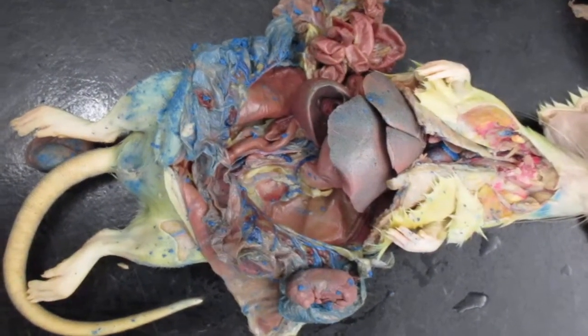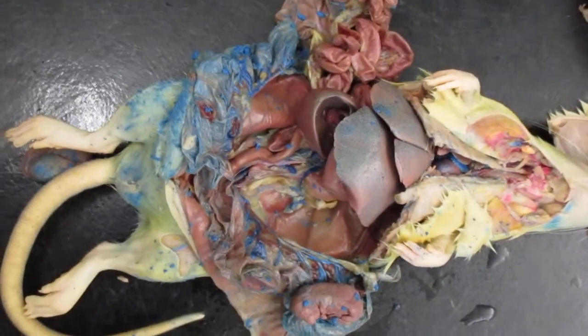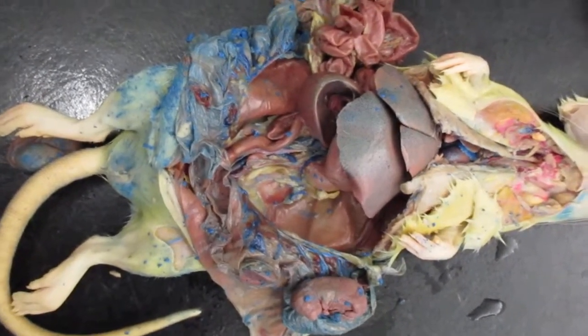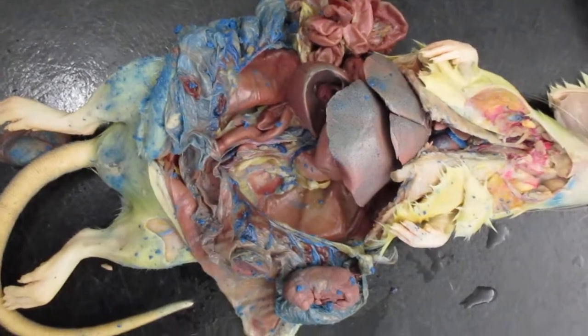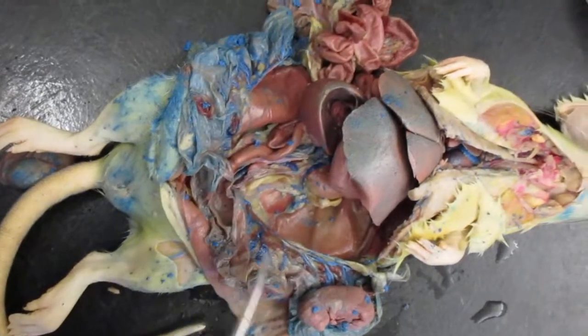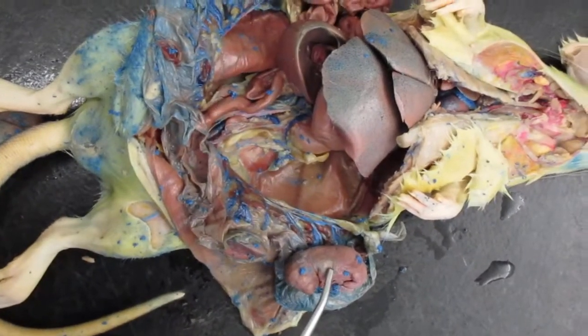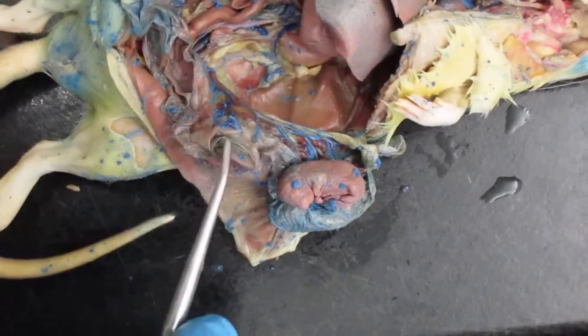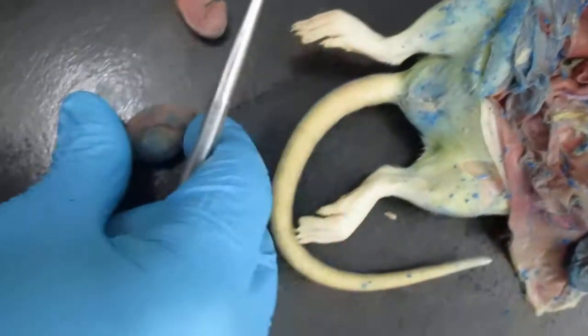Okay, now this looks like a mess right here, but this is a pregnant rat, and you can see that most of the fetuses have been removed. You can see that I have cut open the uterine horn and exposed a fetus here, and we can see this is a fetus, and right here I have this structure.